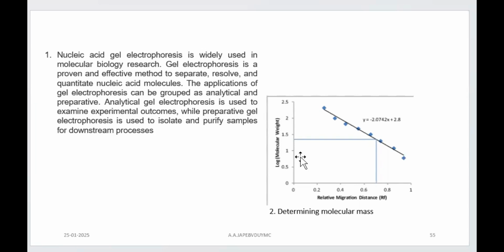Of course we know that SDS-PAGE is the electrophoretic process which is going to separate individual polypeptide chains, and the movement of the protein is due to the charge developed on the protein on account of SDS. Protein has its own charge, but when you treat it with SDS, being a detergent ion, it is going to charge the entire surface of the protein with sulfate ions which get exposed. So minus minus minus charge, and the protein is in linearized form, that we know. We have done SDS in detail.